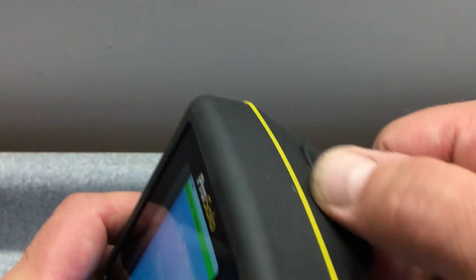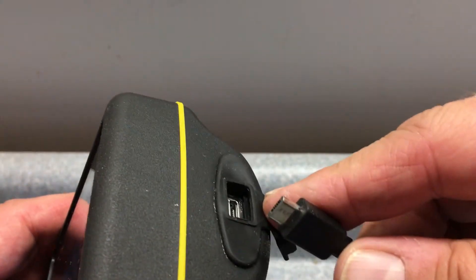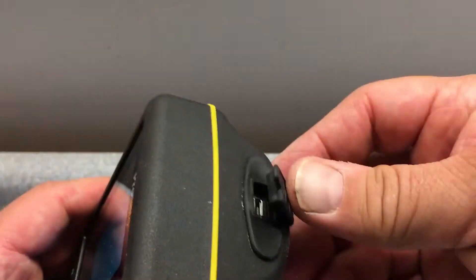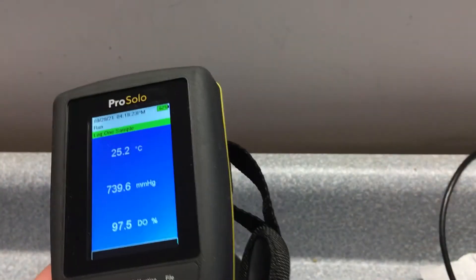Right behind this rubber door is the USB port for charging. Make sure that it's completely closed for water protection when you're not using it.